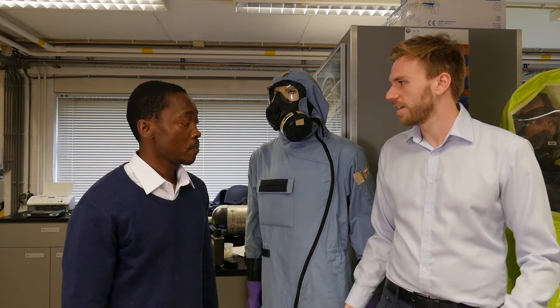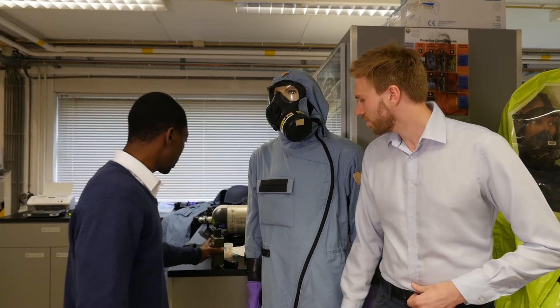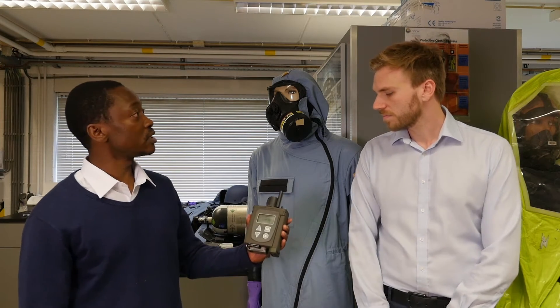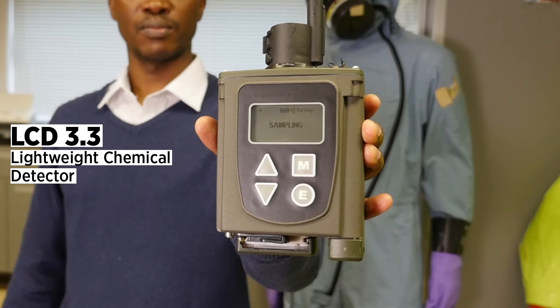So what kind of detector are we going to look at today? Today, we're going to look at the LCD 3.3. Basically, like the name says, LCD stands for Lightweight Chemical Detector. And it's very lightweight — just about 650 grams — and it's very portable.